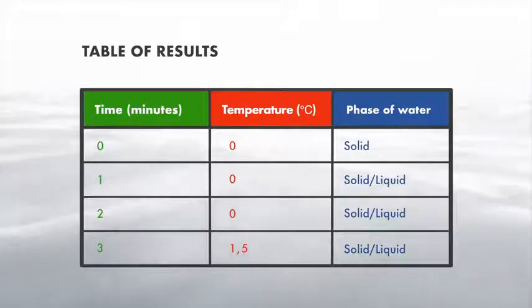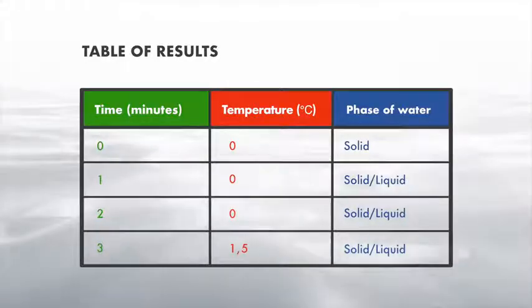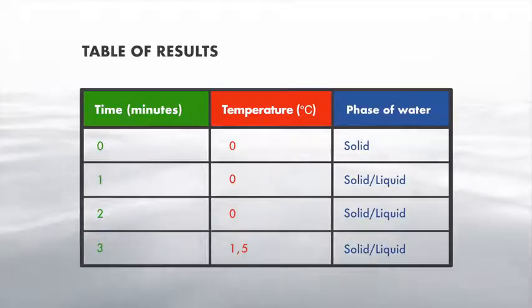Some of you may have made a few mistakes in your table and perhaps you want to correct them nice and neatly. We have printed another table exactly for this purpose. You can transfer your results later and make a clean start.